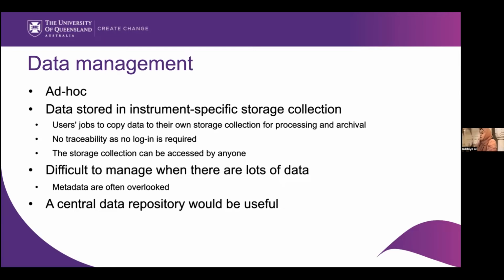The other thing was tracking instrument usage. There was no proper record of who used the instrument and when. For example, if the instrument is damaged somehow and we are trying to find out what exactly happened and who was the last person on the microscope, we were unable to find that. That's where the first step of the Pitschi workflow was defined: to have a proper tracking system to keep the tracking running.